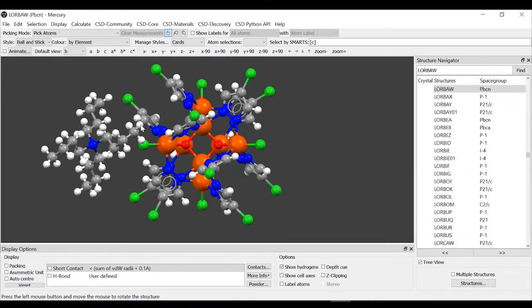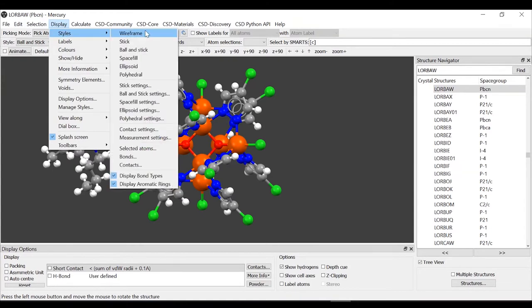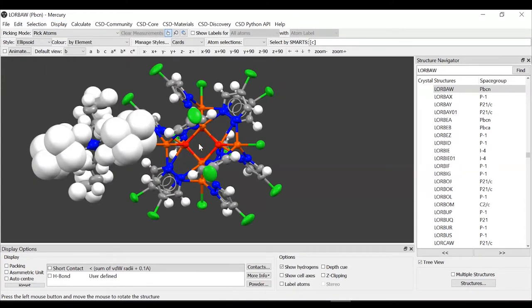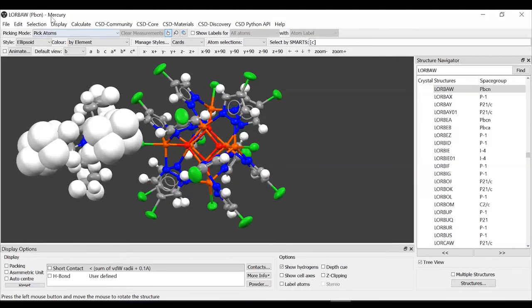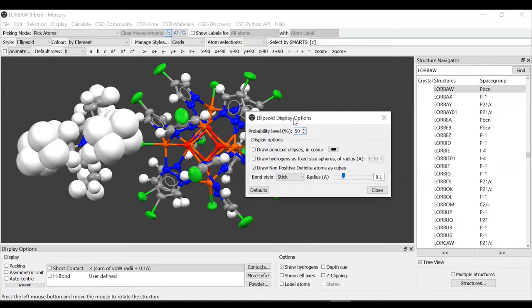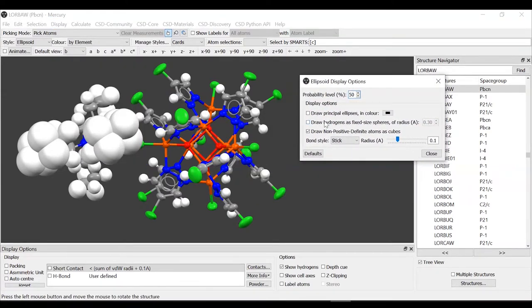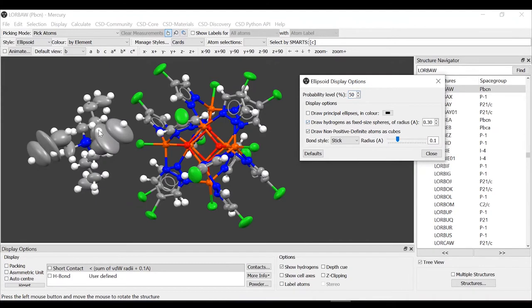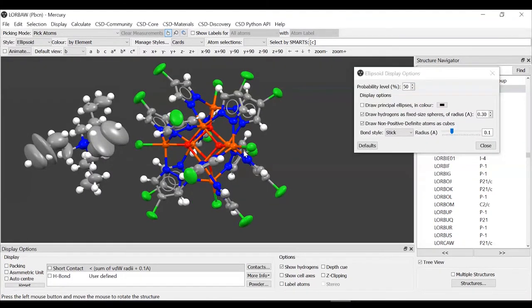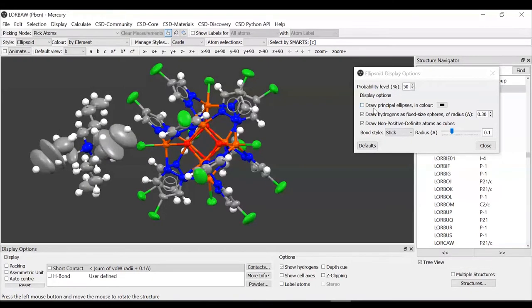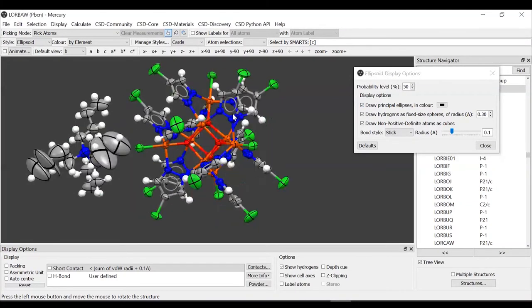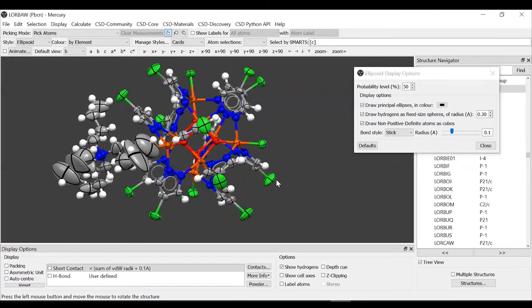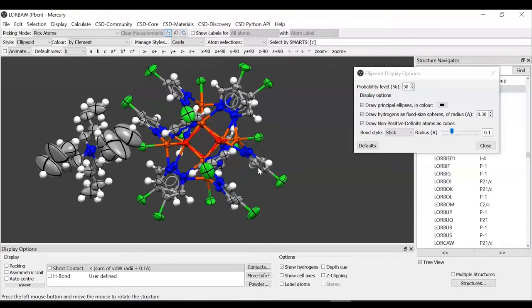The style that we are going to use first is the ellipsoid style, which we will select from display this time. We click display styles ellipsoid. We clearly want to do some edits here. We go to display styles ellipsoid settings. The first thing we want to do is have the hydrogens drawn as fixed size spheres. The other thing that I would like to add is to draw the principal ellipses. We can also select the colors. This is the representation like rag balls that we saw before showing the ADPs.